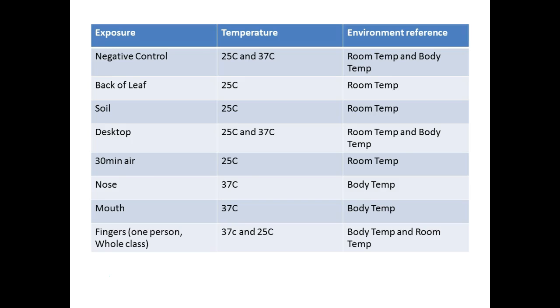So this is the experiment we did today, right, and I'll take them out of the incubator tomorrow or the next day so they don't overgrow, put them in the refrigerator, and we'll see the different types of growths that we get from the different exposures we did and compare the different temperatures.